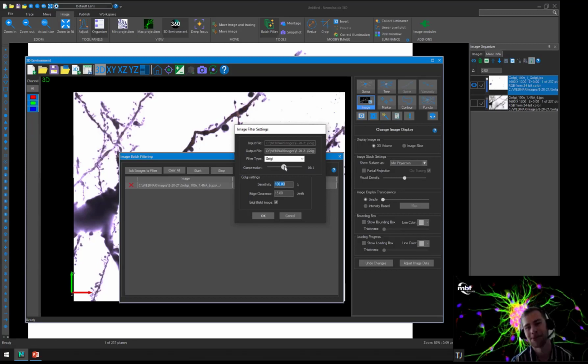If you keep a similar technique for acquiring your image stacks, there's a likelihood that the same sensitivity setting should be applied to the animals that you're imaging. However, if you return a month later and you have new image data, it doesn't necessarily mean that 100% sensitivity will be the same when it's applied to your data from March as it is to August. And that's all depending on how the image has been acquired.